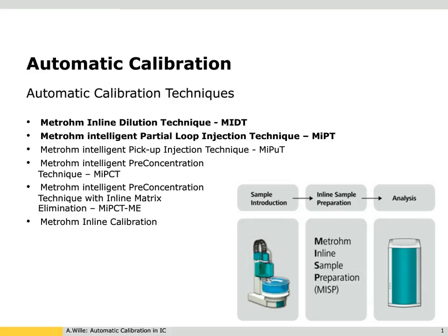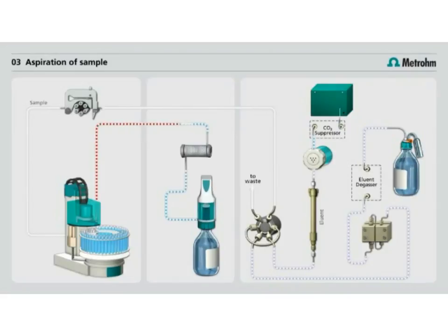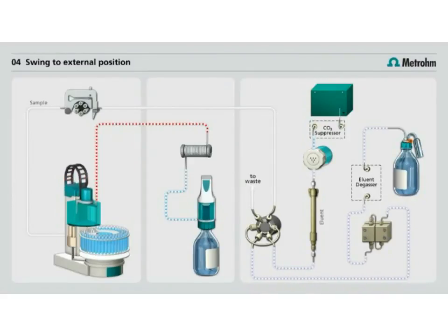The Metrohm inline dilution technique. The first technique which I would like to explain is the Metrohm inline dilution technique. You see here on the slide how it is running. On the right side you see the ion chromatography system, on the left side the liquid handling part. And the needle is already in the sample and aspirates the sample to a buffer tubing. The buffer tubing is about 10 milliliters, so you have enough space for your sample.